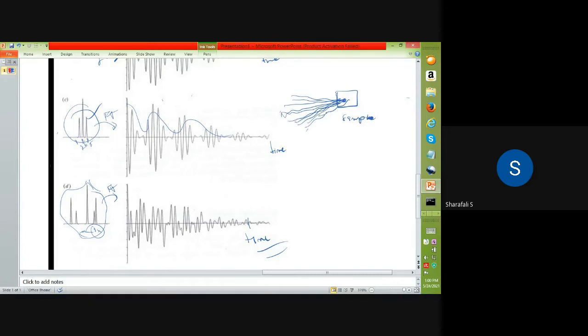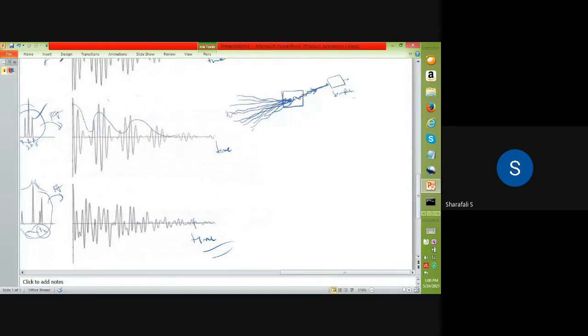And we will take the interference. Actually, this will happen in that mirror. Sorry, this will happen in that mirror. I will explain that in the next class. So this will happen in the mirror, and after this interference, the signal will be passed to the sample, and then it will go to the detector.